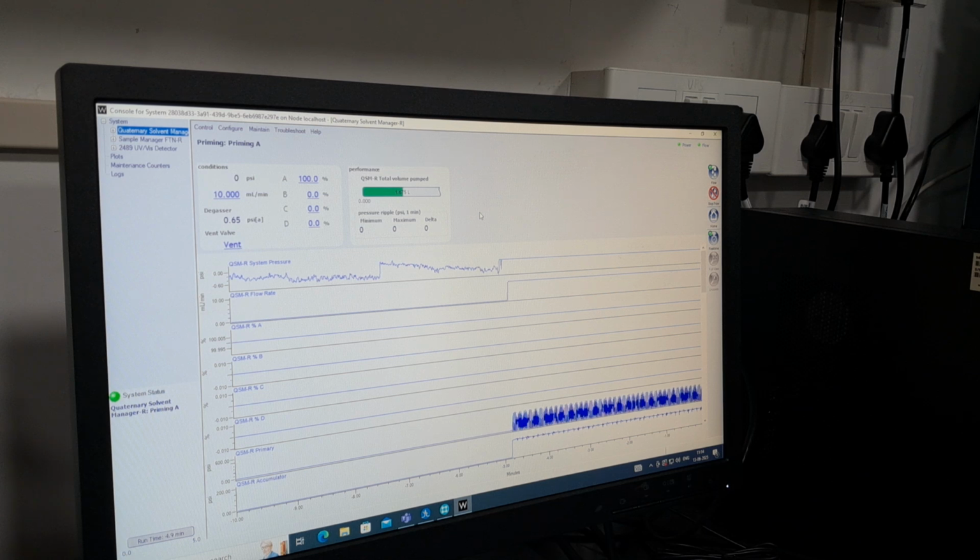So in future we have to run this, so we need the 0.02 micron filter, the catalog number on DSA, and then this type of vials, I think I have to give extra for that. So can you please send at least a very rough estimate today? Very rough. I don't want the exact.